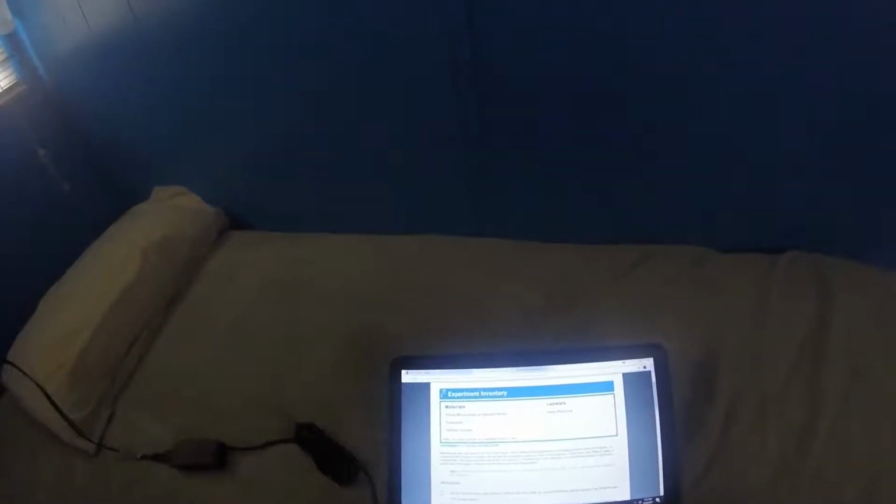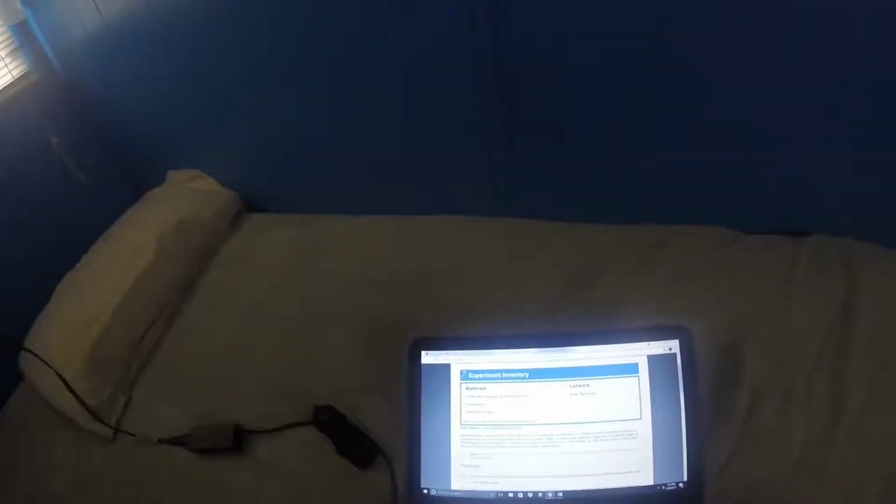Okay, so experiment 3 is a virtual microscope. Microscopes are used across the field of forensics, from observing cell specimens to comparing fractured particles in glass. Microscopes help forensic scientists see minute but important details on crime scene evidence. While there are different types of microscopes, most have common structures and functions in similar ways.